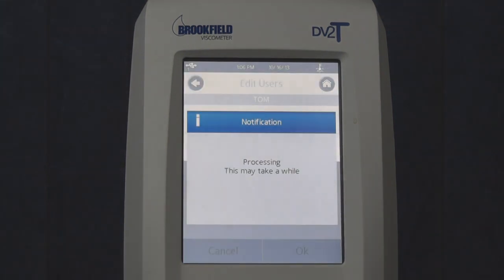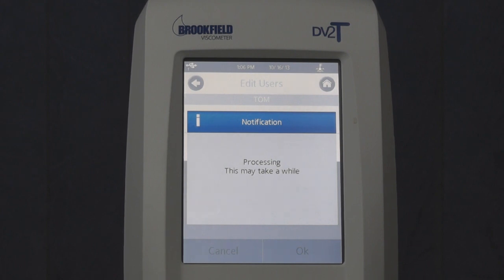Touch OK. When the new user logs in for the first time, he will be prompted to set his own password.